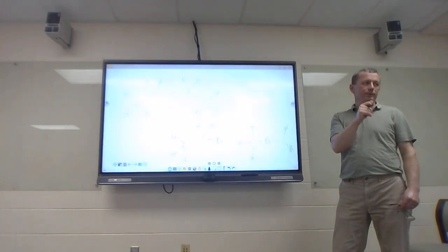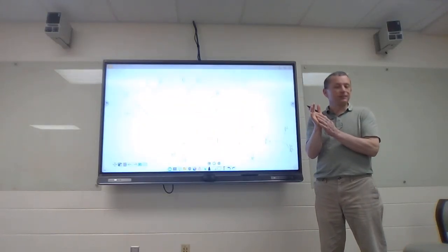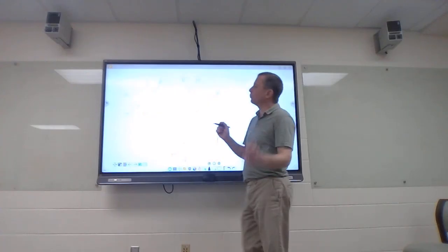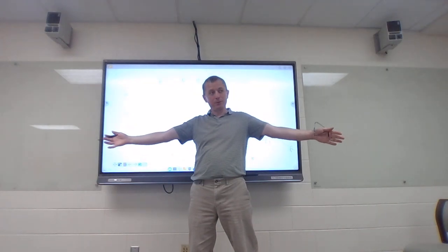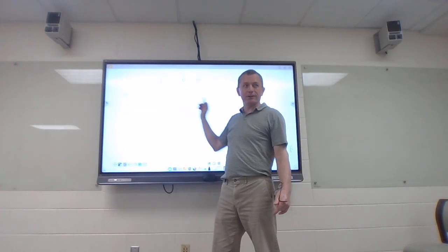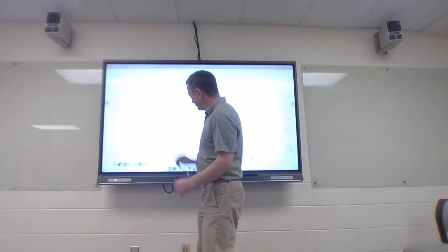I did that on purpose because I can actually set that integration. It's relative. Integration is relative. It's saying that one peak has a 2 to 3 ratio, which is the same as 4 and 6.